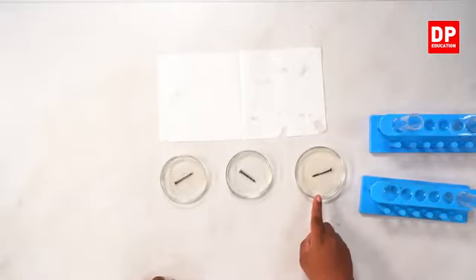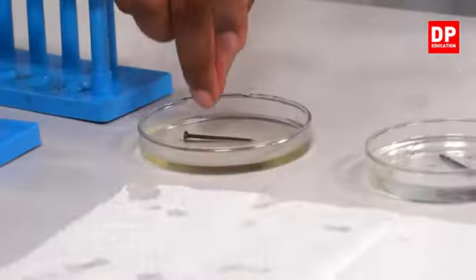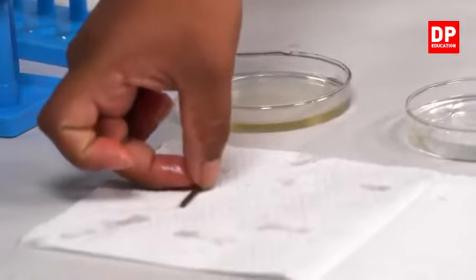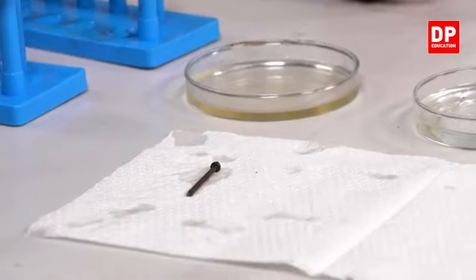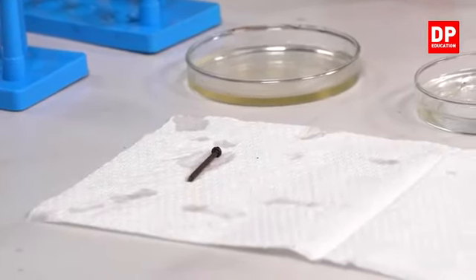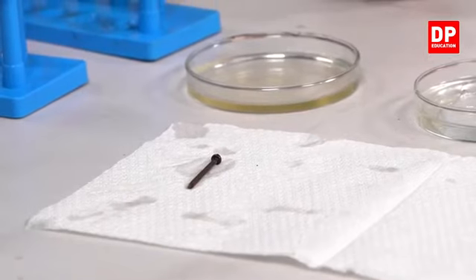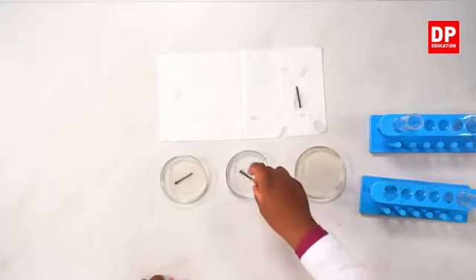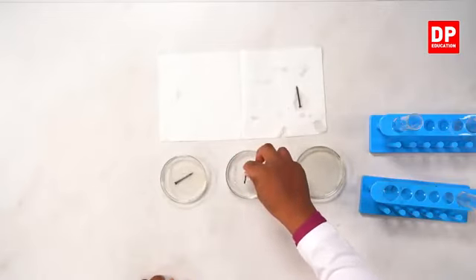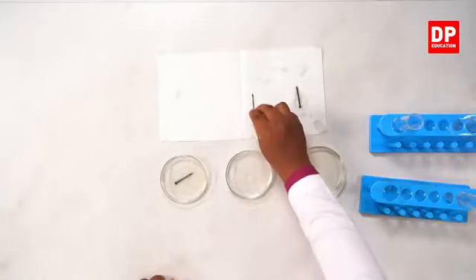There is no coconut oil in it. So this is the first one that contained normal water. Check how the iron nail has rusted. Normal water. Second one, normal water plus some amount of coconut oil.